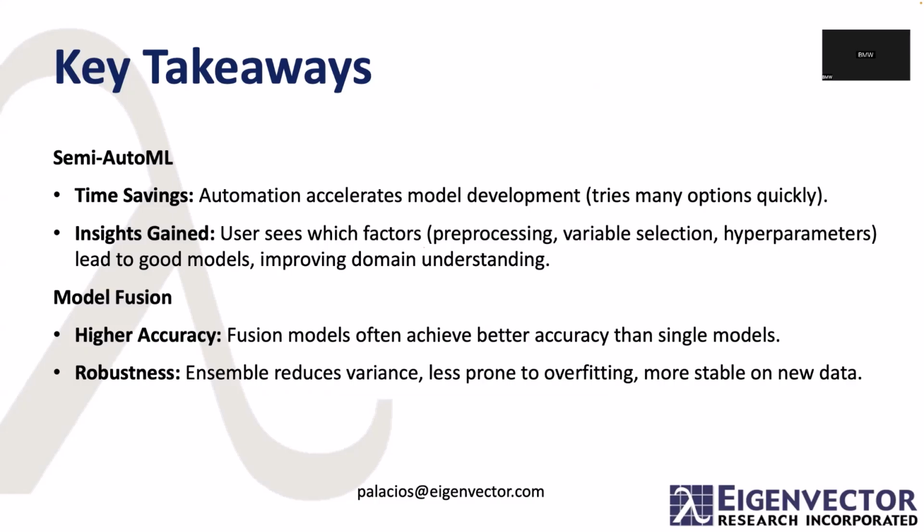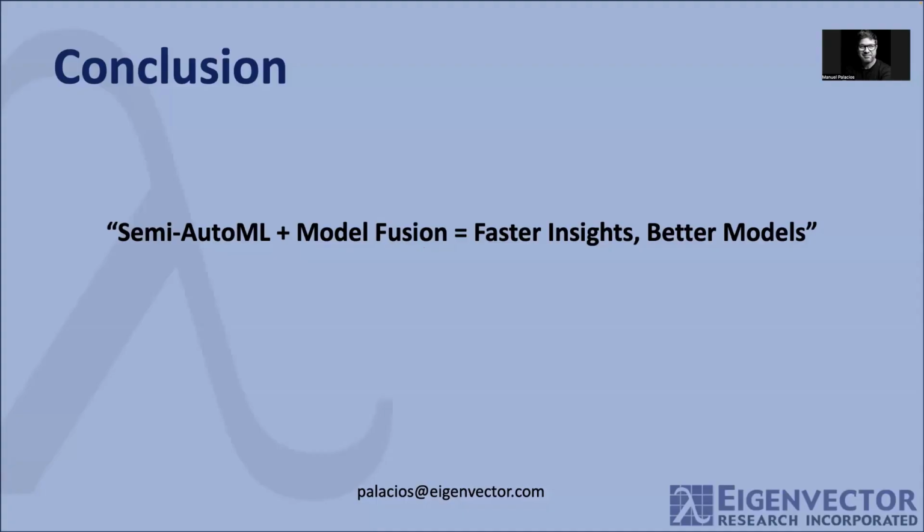And what's the next slide? But just before we move on, one thing I didn't mention is that the way we handle ensemble models is already integrated in the PLS Toolbox. So this is a model object, just like any object you had before. To apply it to new data, you just do .apply. So this is really easy to take and deploy. Wow, .apply, that's for all you command line geeks there. Yeah, sorry.